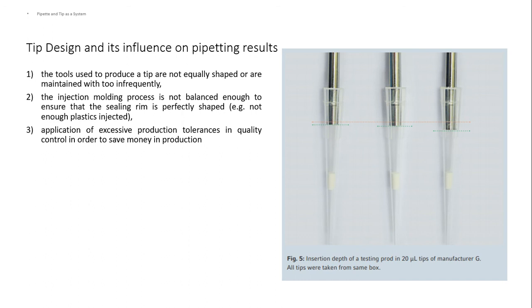The tip diameter is not the only factor. The connection between the tip and the pipette cone needs to be tight enough to prevent air passing through. If the tip is not tight, the system does not aspirate enough liquid and may leak. In the worst case, the pipette is obviously dripping, but incomplete tightness is often not recognized during daily lab work.